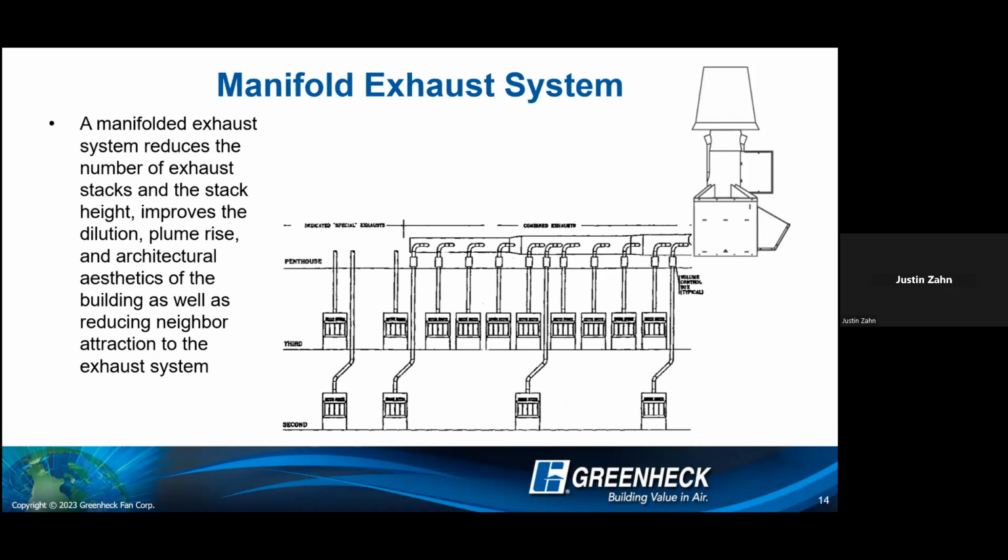One thing to keep in mind with this system is there are certain chemicals that you do not want to mix, as I'm sure everyone is aware of. So there still may be times where you need to have 1 fan per hood, depending on what's going on in the space below. But most of the time, on standard jobs, you will have multiple fume hoods going up into some kind of common ductwork and then into the fan.